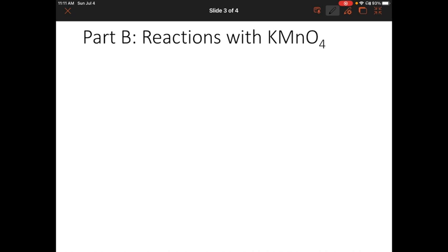All right, let's talk about part B. In part B, we're going to perform reactions with something called potassium permanganate, KMnO4. All right, so in this reaction, we get an oxidation reaction.